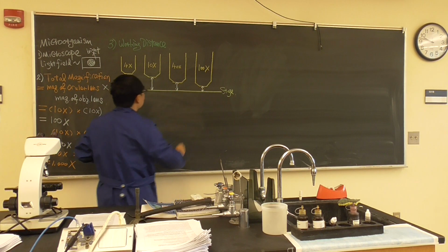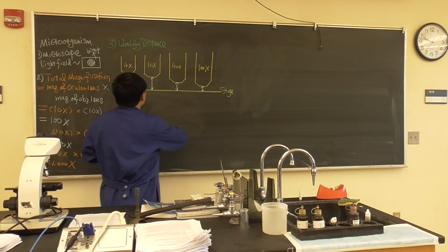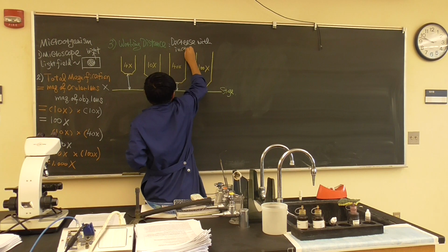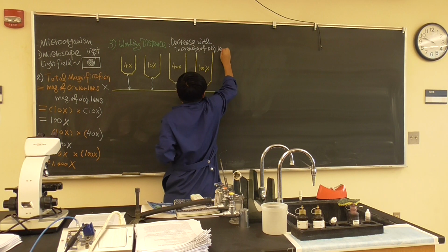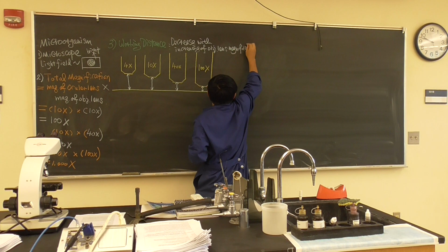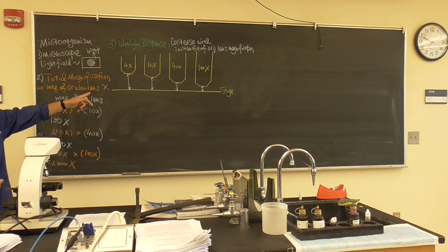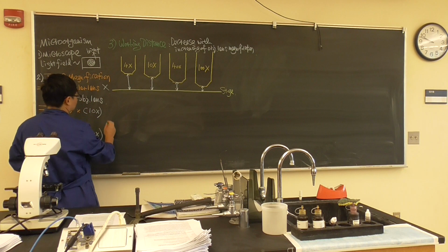So you can see the working distance is decreased with increasing of objective lens magnification. Okay, that's a working distance. That's why we're going to talk about working distance, because we have another concept which is very important we want to mention.